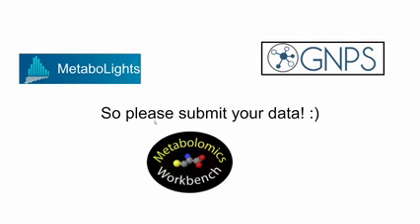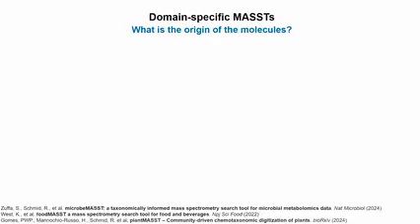And it doesn't really matter, maybe as a final point, which repository you use for uploading data. We are trying to always make use of everything. And with that, I will again move on to more exciting stuff about how to make findings, I think with Vincent again, right? Yeah.